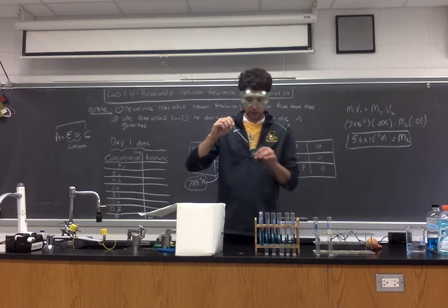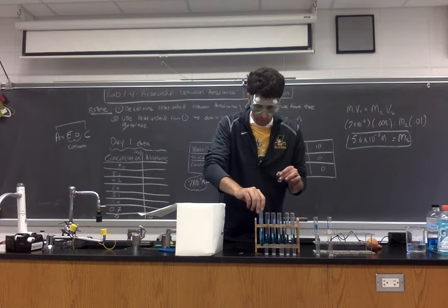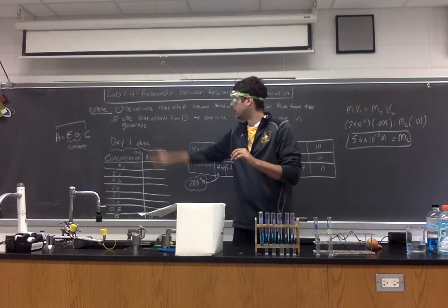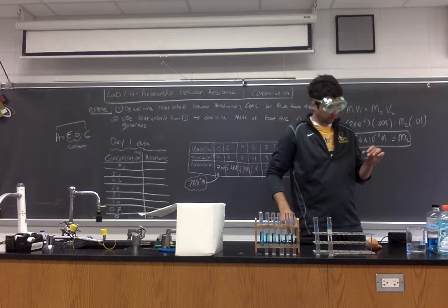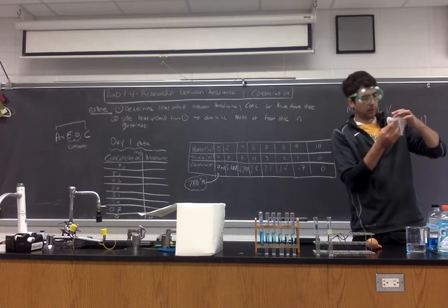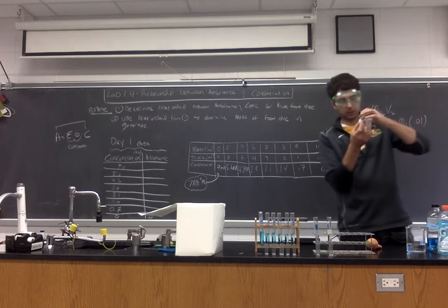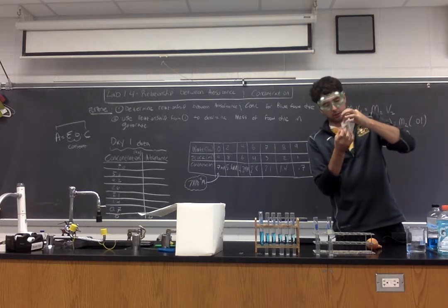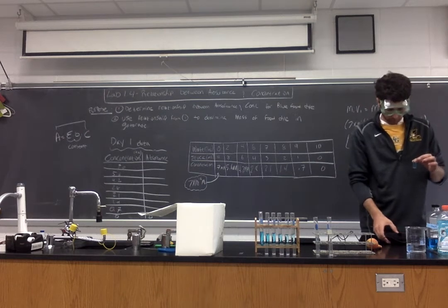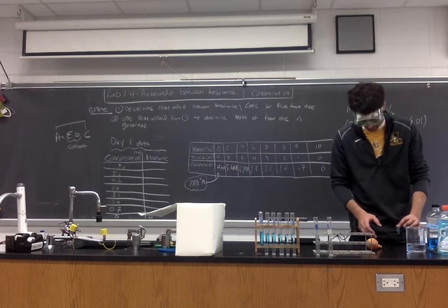What is the concentration going to be? Or what is the absorbance going to be? Let's find out. So we have stock solution. I'm going to wipe off any smudgy fingerprints. Now let's get an absorbance reading.